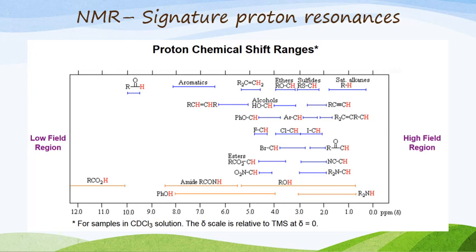So if we wanted to interpret an NMR spectrum, it becomes very useful for us to remember this so that we know roughly where things are when we get an NMR spectrum.